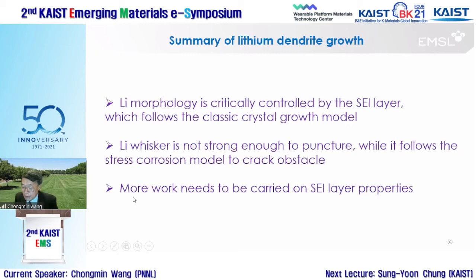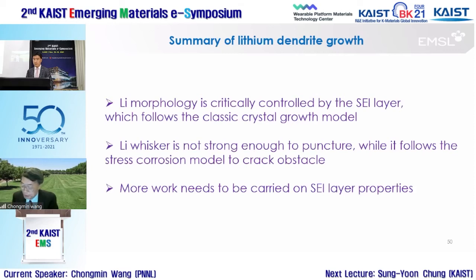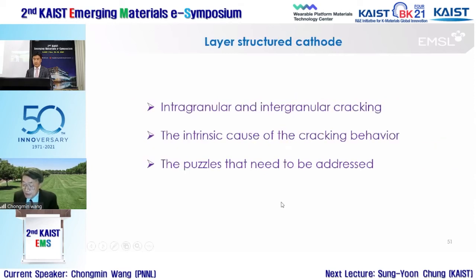Based on my understanding, I think more work needs to be done about the SEI layer properties, a lot of work along this direction. I think that's what we can capture from the in situ work. So the last thing, I'll talk a little bit about the layered structure cathodes.